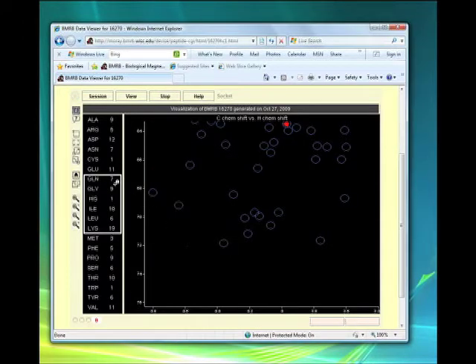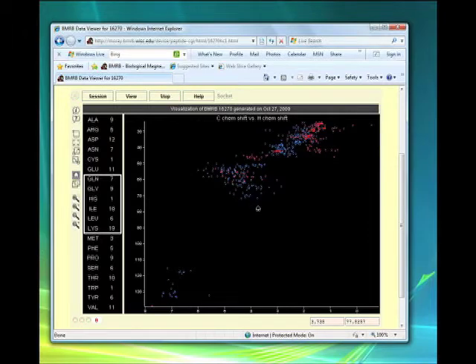Continuing on, the next mode is what we call Home mode. Once you've zoomed in on a view, you may want to zoom back out to display everything there is to see in that view. In Home mode, when you click anywhere in a view, it zooms out to show all of the data in that view.